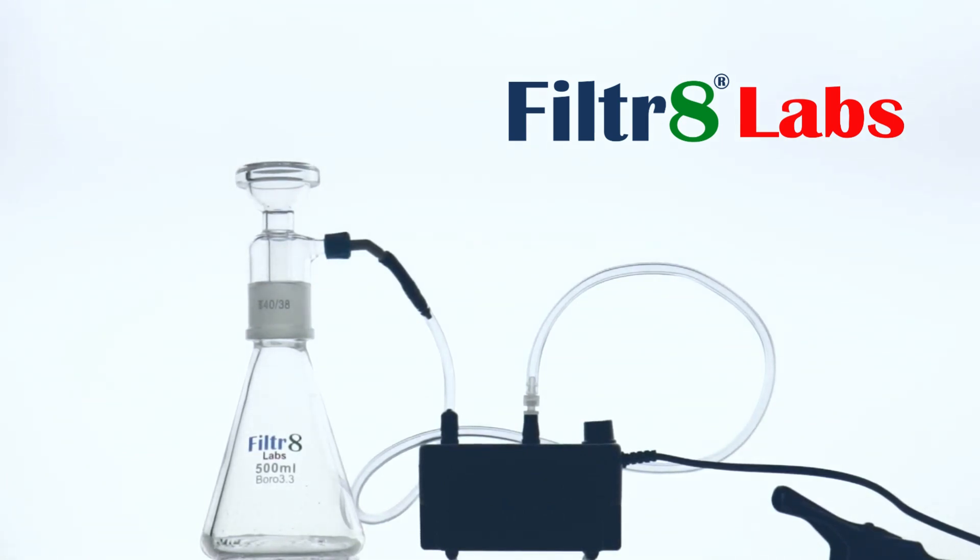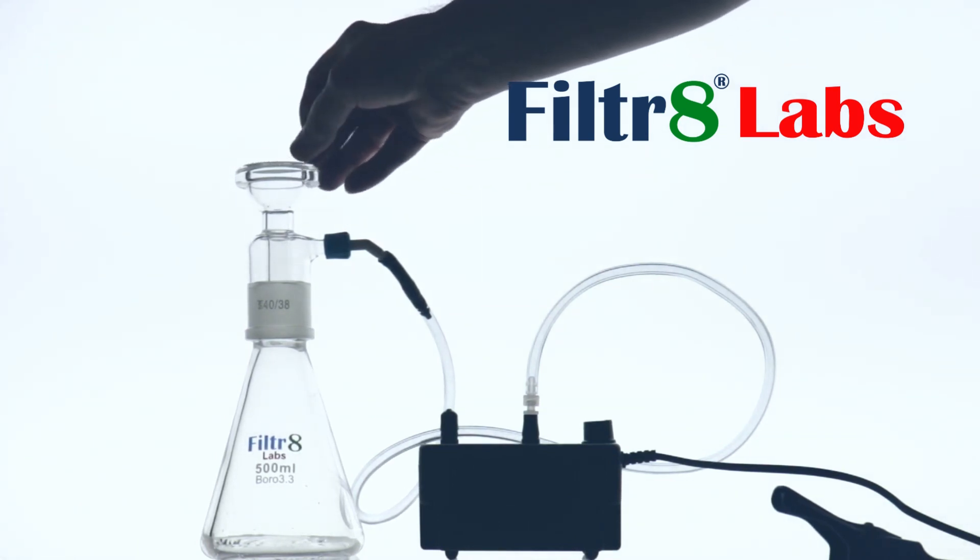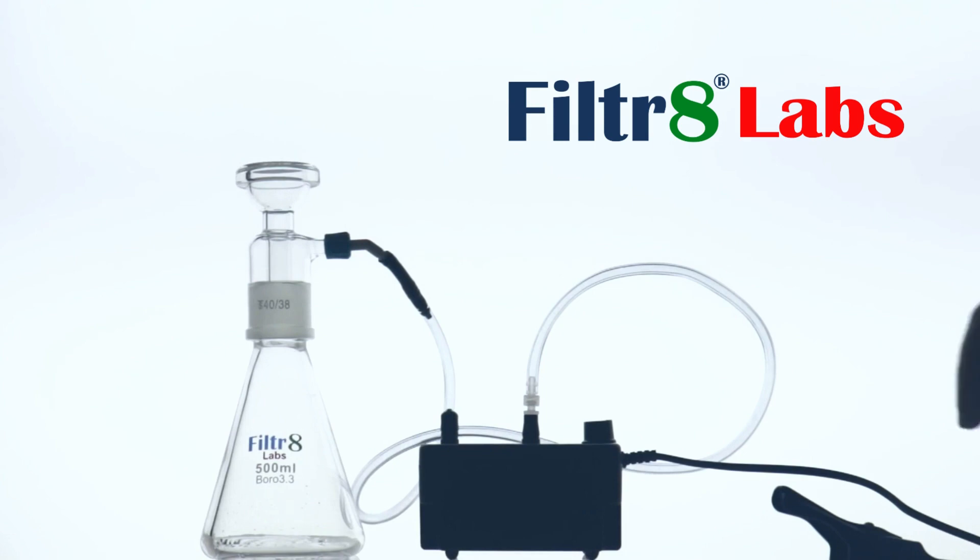We've got one of the Sandcore filtration kits here with a Pro version pump, and I wanted to show you a tip for making sure that the filter paper has a good seal.